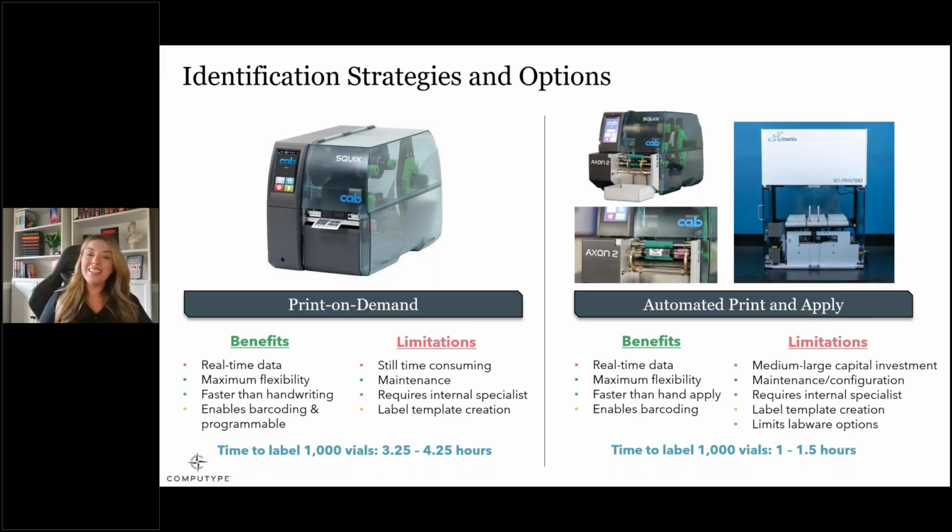It also limits the labware that you can use by a bit, because each piece of equipment has its own specifications, meaning that it can accommodate certain sizes of labware, and you'll have to make sure your labware fits within those specs. And if that equipment does happen to accommodate different sizes, there's likely going to be some kind of modification or adjustment step that has to happen between runs.